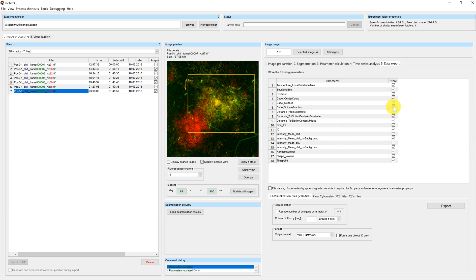By selecting the checkbox 'store' you can decide whether the parameter should be included in the exported file. If the size of the exported files is small compared to the image data and you are comfortable scrolling through all the parameters in your third-party program, you do not really need to exclude parameters from the export. The only reason to do so is to reduce the file size and more quickly access the most important parameters.